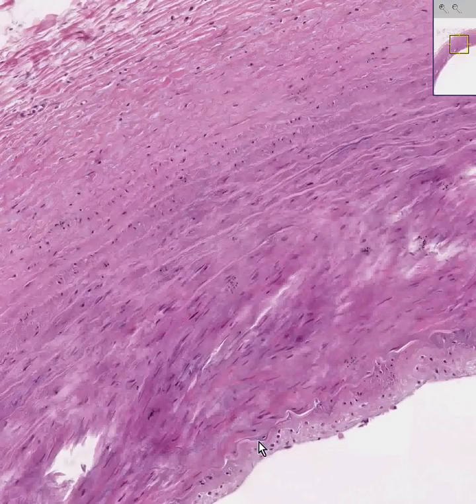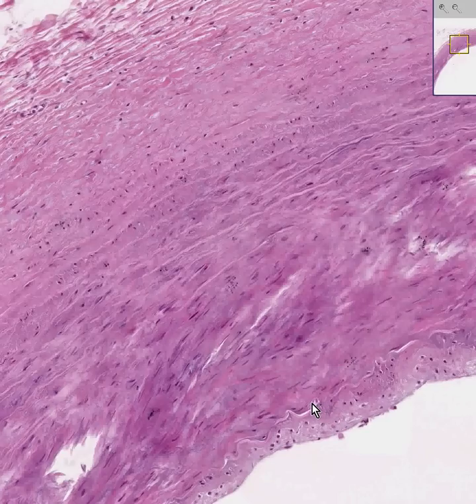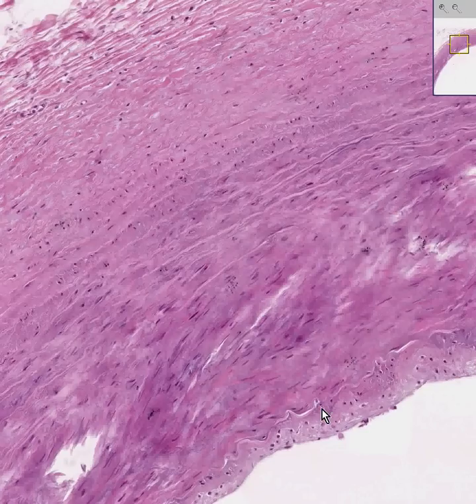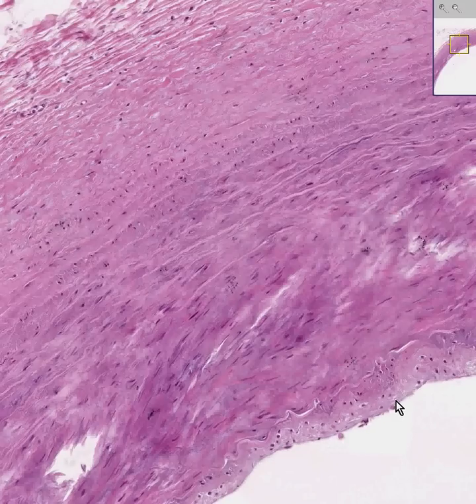Then you have this large, wavy, squiggly elastic fiber called the internal elastic lamina. Everything deep to that towards the lumen is the connective tissue of the intima. And if you're lucky, and if we looked around, you could see individual endothelial cells lining the lumen.